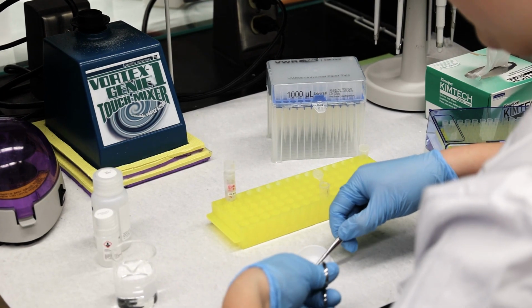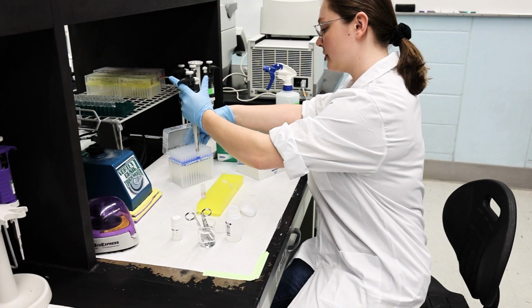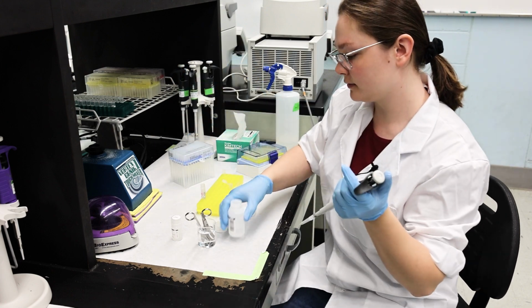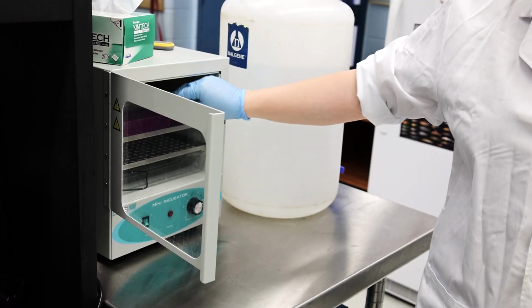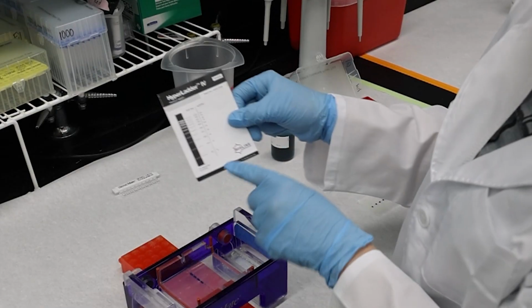Once we get to the lab here in Fairbanks, we extract the DNA from those filters that we collected in the field. We PCR amplify those barcodes or gene regions that we've targeted. We send it off to a sequencing center.